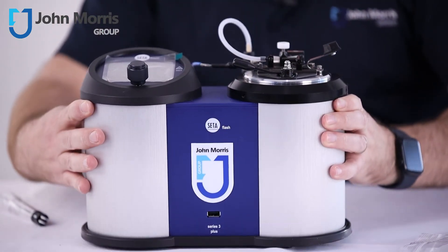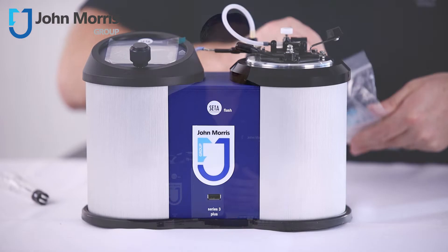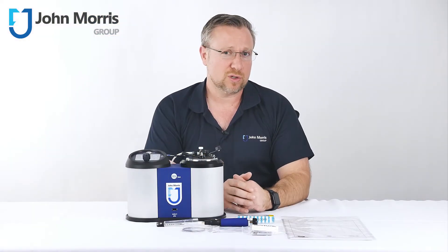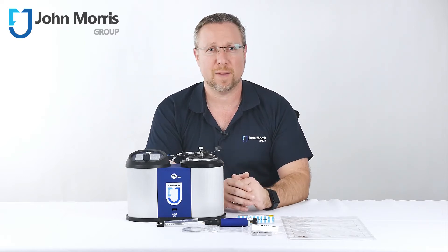The Setaflash Series 3 is an affordable yet capable flashpoint tester equally at home in a high-end refinery or even a waste collection facility. They're also used in cosmetics, aviation, manufacturing of paint, varnish, and many other applications.